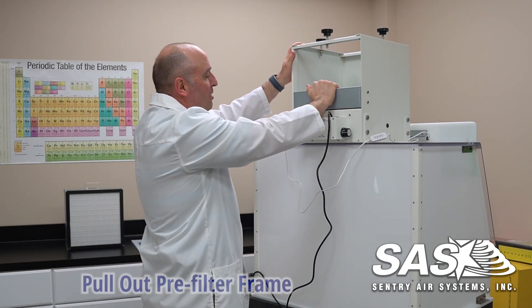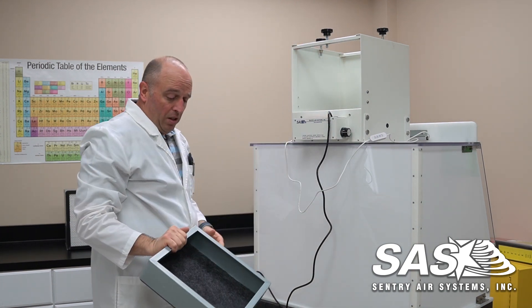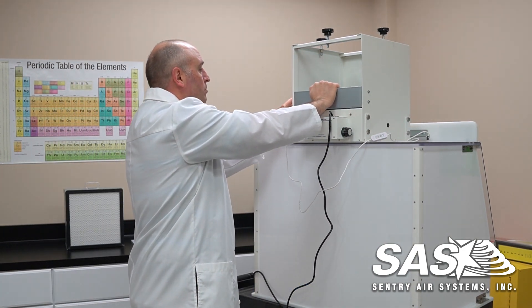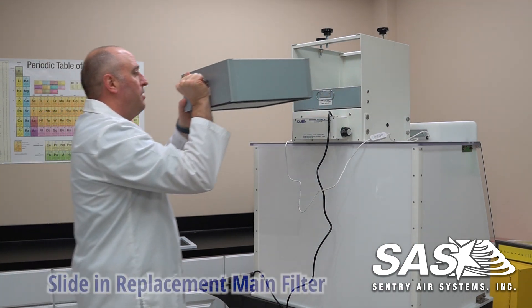Depending on your application, come back here, get your pre-filter and pull this out. Once you have your replacement filters, simply slide it back in. Then get your next main filter and slide this back in as well.